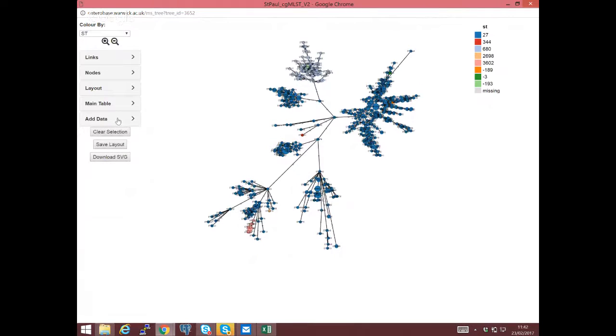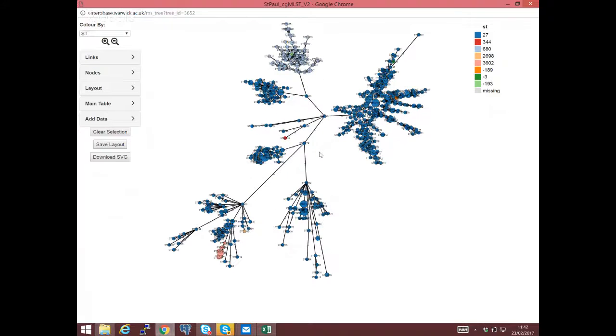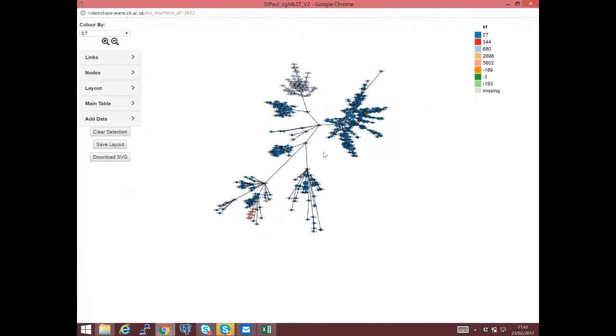So I have a question on that. Yeah. Okay, there's a couple. Firstly, I think the question is, I think I read you may be adding AMR. Is this coming soon in the pipeline? Not that soon. We have discussed this, but we haven't actually done any coding for it yet. Will you show the custom coloration? Yes. Okay, yeah, I'm on the trees. On the tree. Okay, yeah.